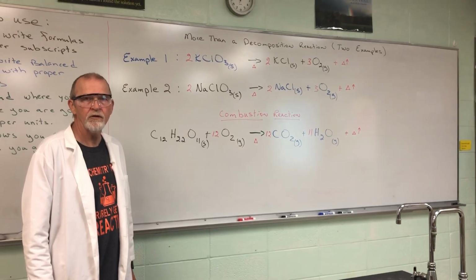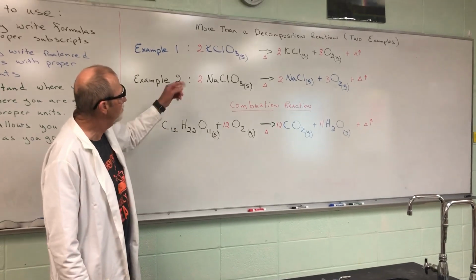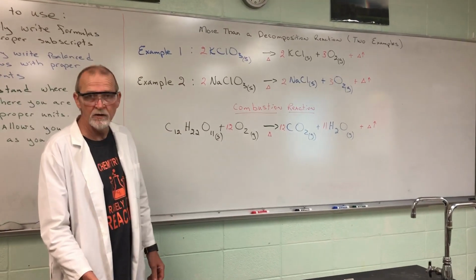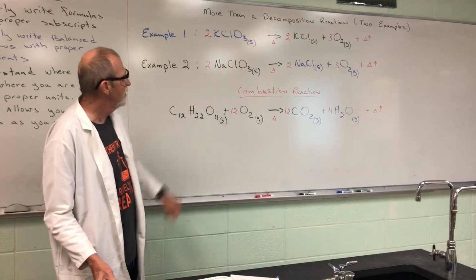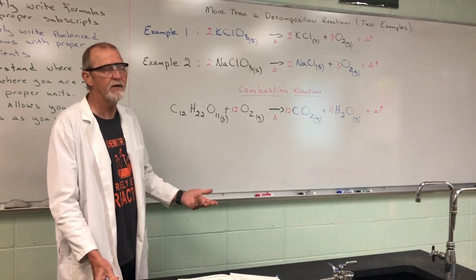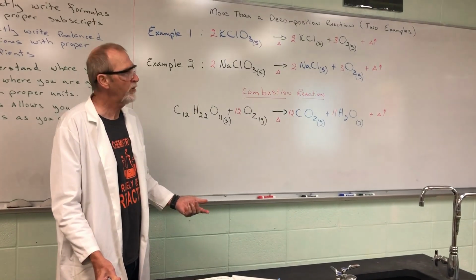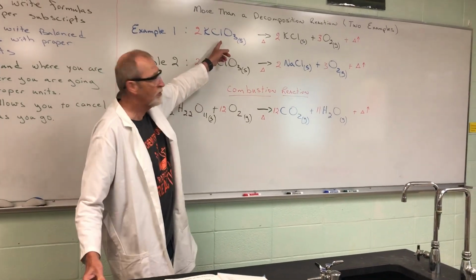Guys, so we're doing another reaction today, actually two. This one's called more than a decomposition reaction. We're doing potassium chlorate and sodium chlorate to show that you can have predictability with one reaction based upon the radical, in this case, which is the chlorate.